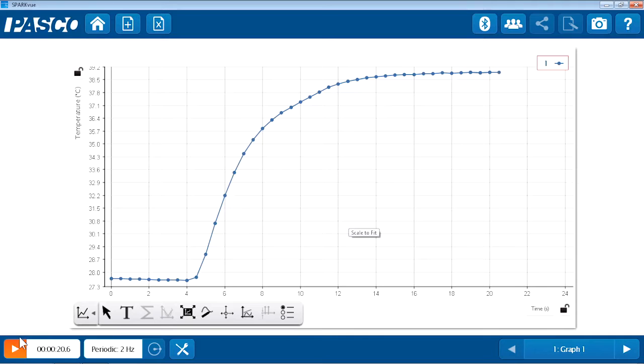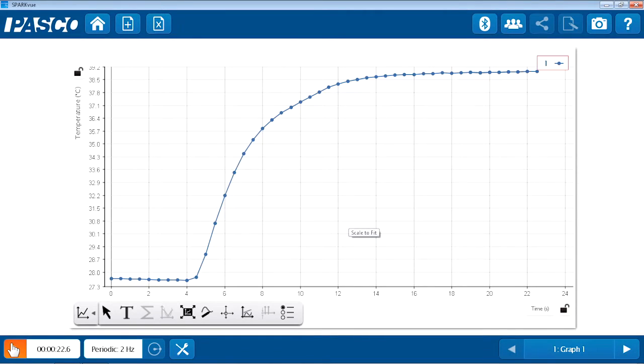Oops. And because they are rugged and water resistant, they will definitely be able to withstand those student oops that you're bound to have in your classroom. Still collecting data. Still collecting data.